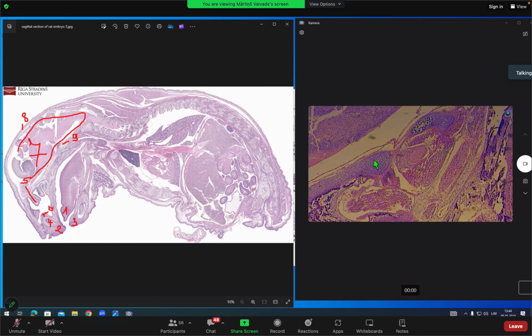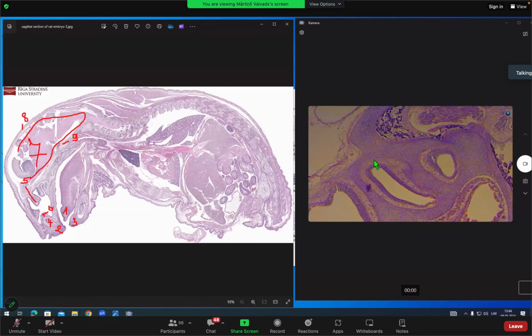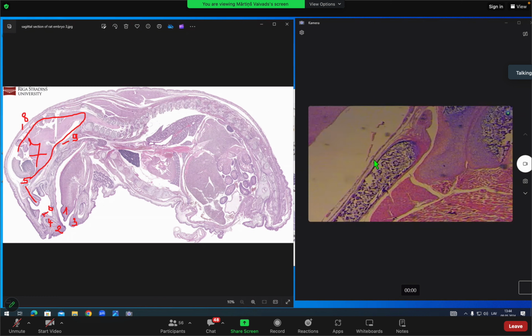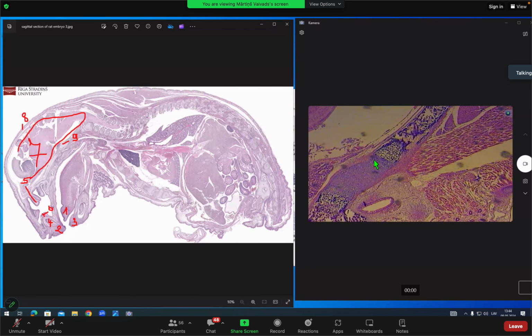Here there's a big plate. On this slide there are small fragments. In some slides you might see even inner ear development, like in the microscope. Here it's not that nicely visible, but chondrocranium stands out a bit, a plate of hyaline cartilage.